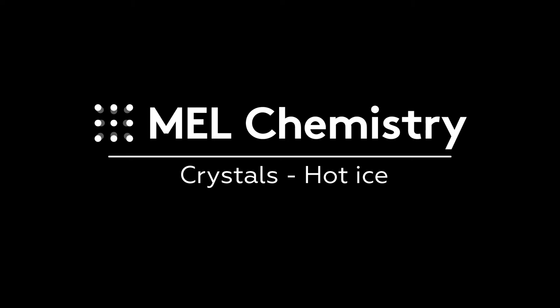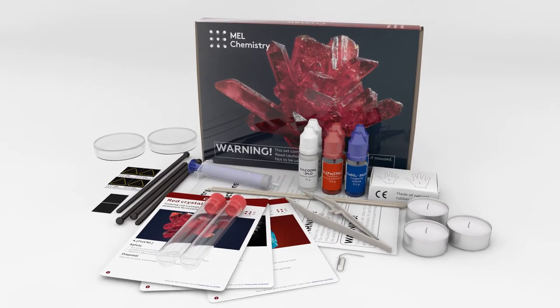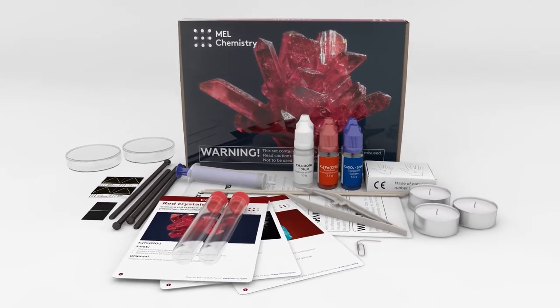Welcome to the wonderful world of chemistry. Today, with the Crystals Experiment Set from MEL Chemistry, you'll discover that something that looks like ice may actually be hot.